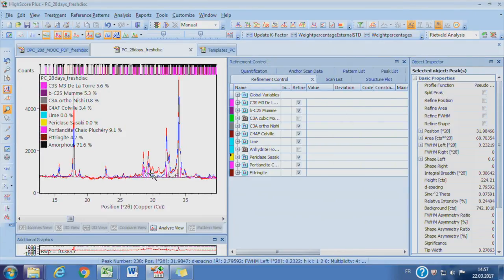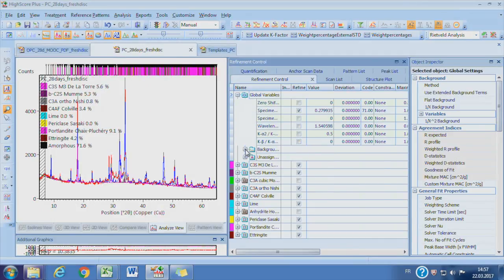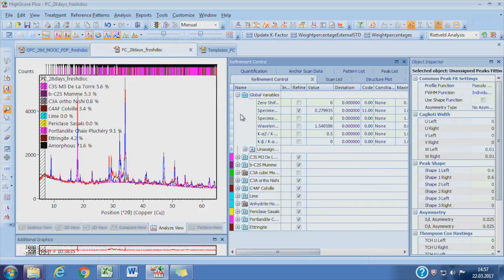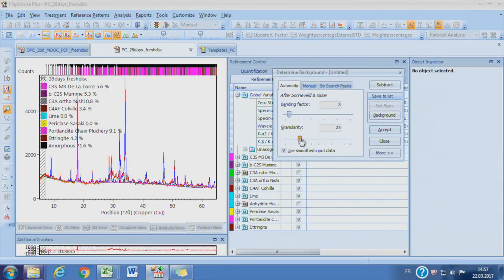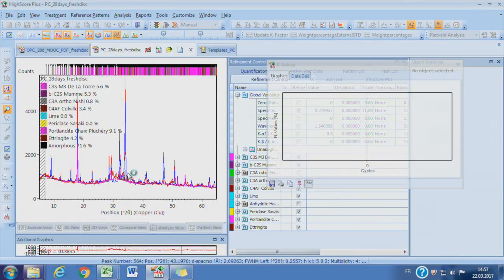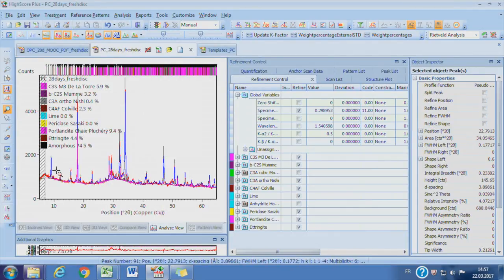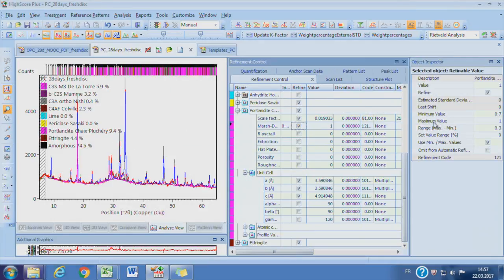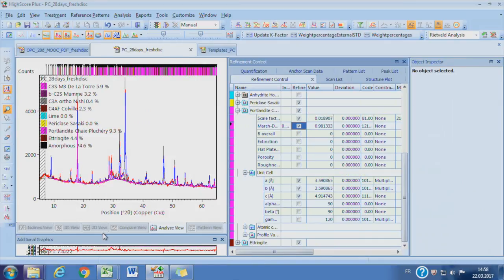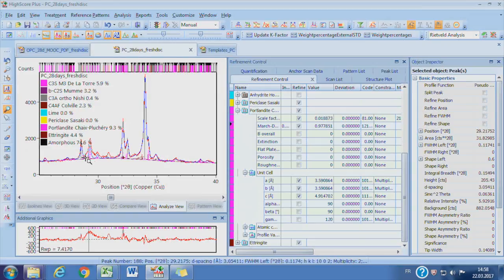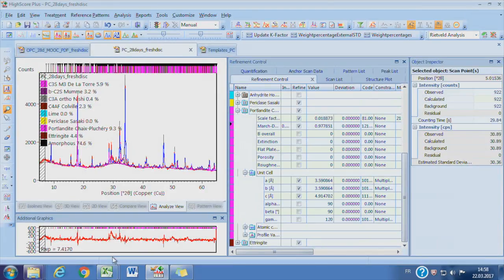The polynomial function is not powerful enough to fit the broad hump from the C-S-H contribution in the hydrated cement. So we change the background function to the manually determined one: click the global variable, then background, and change the type of background function in the object inspector from polynomial to Use Available Background. In this way we can define the background function by ourselves. By changing the granularity and bending factors, we should have a background curve following the lowest background of the pattern. Refining again, you should get a much better fitting. The manually determined background works well for the hydrates.